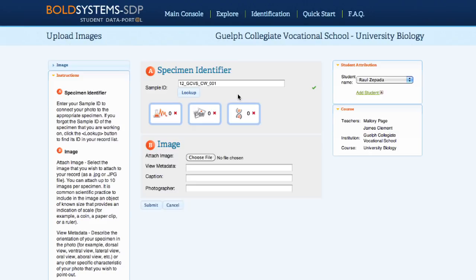Once the sample ID has been entered, students will be able to see record progress, listing the number of images, trace files, and sequences uploaded to a record.